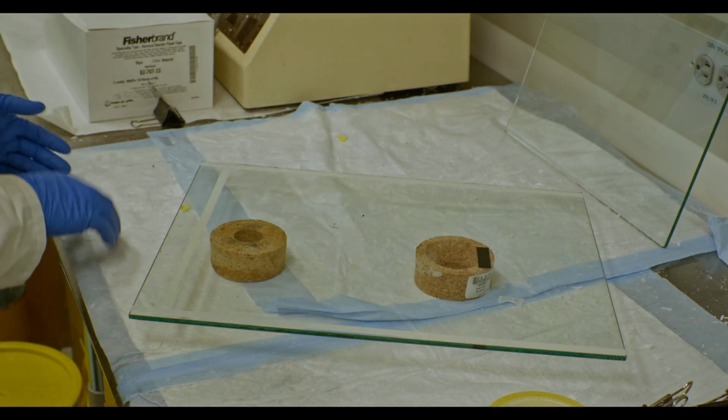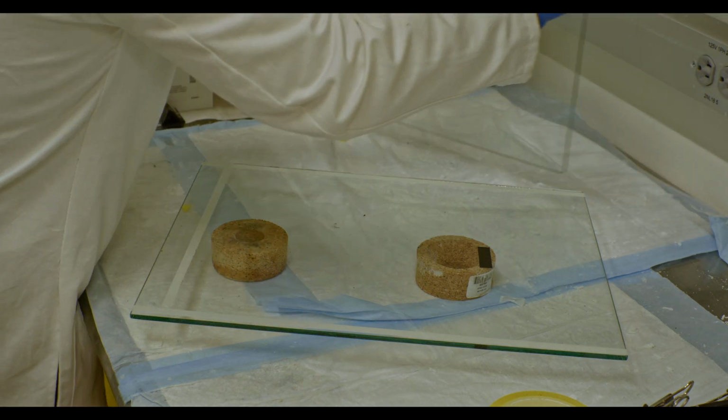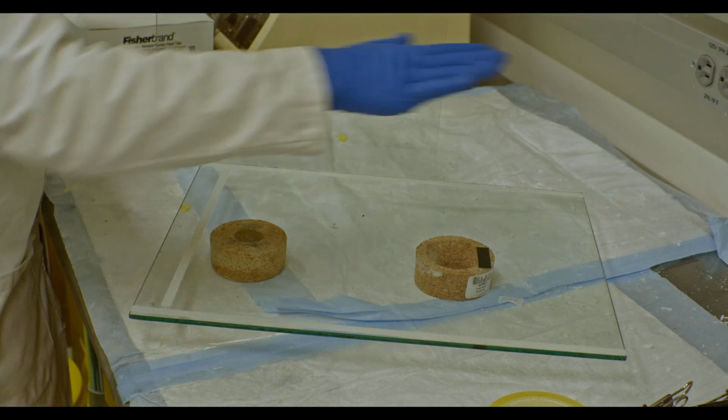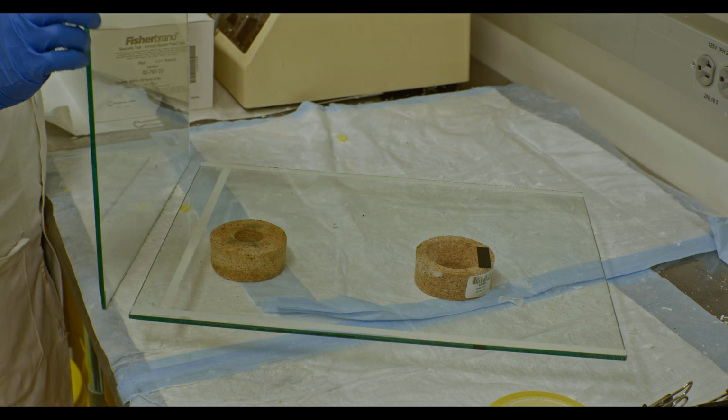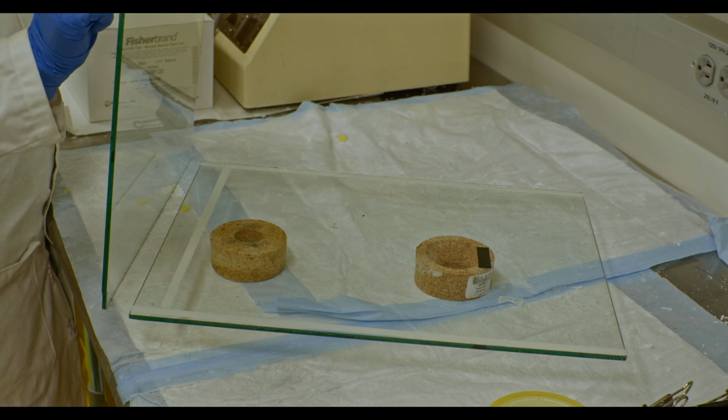Of course, you could also ask the question, then why do we put the spacer there at all? Well, we put the spacer there to not overcomplicate the gel, because then it could easily leak out, or it's easier to make a smaller gel than it is to make this much longer gel.